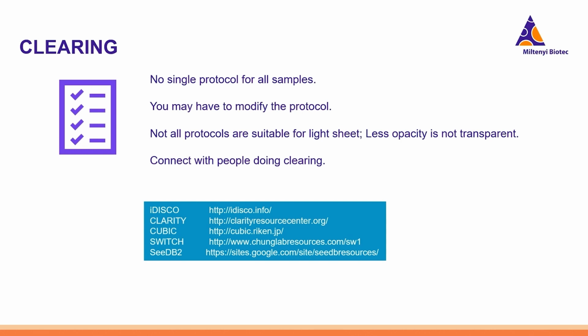So when it comes to tissue clearing, I hope I convey there is not a one-size-fits-all protocol. Selection of your clearing method will depend on the tissue species, your intended application, amongst other considerations. There will always be the possibility that you may have to adapt or modify your protocol to achieve true refractive index homogenized samples. Not all protocols will render samples clear enough for light sheet and therefore may not be compatible with this technology. But there are a lot of resources out there, including myself, to help you navigate and find the method most suitable for your application.